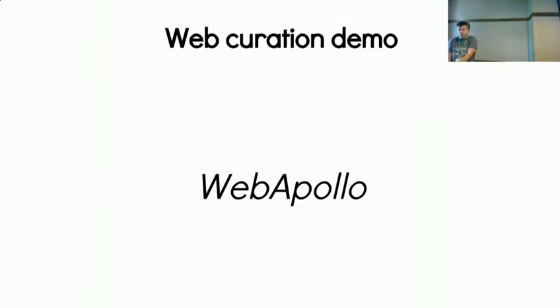You absolutely don't need to use it within there, and you can always export stuff and then upload it directly. Having it run within Docker in a suite like GVL, I think makes sense. It's up to the people who end up using that product in terms of how useful it is to have it in there. It's pretty easy.